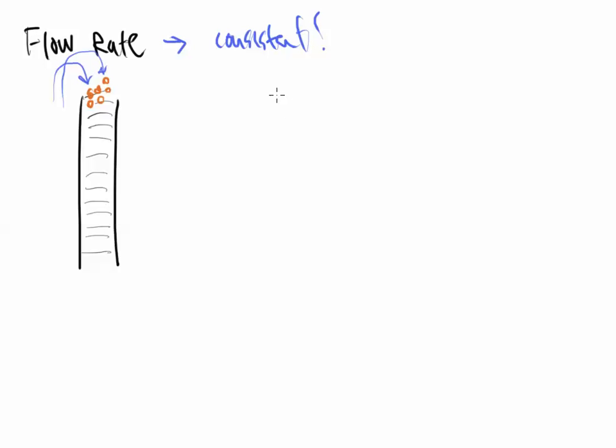The typical flow rate is provided in milliliters per minute. So for example, one of the labs that I might do in an experiment on a daily basis is running something at a half mil a minute, 0.5 milliliters for every minute that the machine is on. This is typically the standard flow rate that I often see, and I don't really see anything below 0.5. It's kind of the cutoff value, but at the same time, it's also the widely used number that's out there for the most part. A half mil a minute.